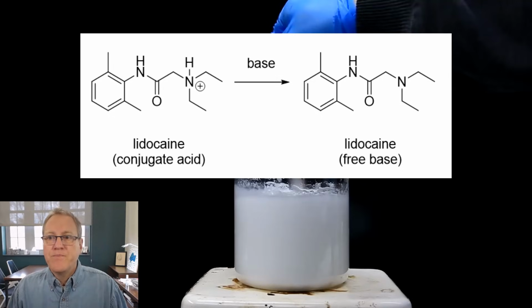So this is the lidocaine at pH 7 will actually be protonated. It exists as a salt, and that's an ammonium salt. And as you add base, that base will deprotonate anything that's acidic in the solution. In this case, eventually it'll get around to deprotonating the lidocaine, and that forms the free base of lidocaine. And it turns out that is not water soluble.